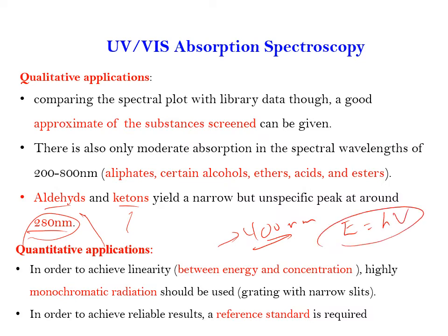So identifying the energy or intensity, in other words the incident intensity and output intensity, can help us identify the concentration of the sample or molecule. This way, it's possible to have quantitative identification of molecules, or concentration determination using spectroscopic techniques.